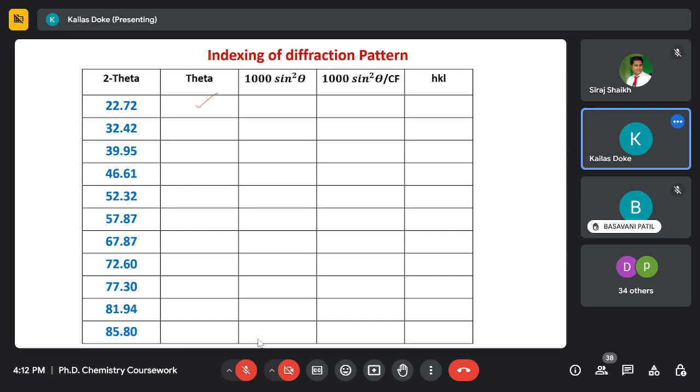Sine theta will be a fractional number, and the square of that fractional number is a further smaller number. So to convert that smaller number into a bigger number, multiply by some bigger integer number. Either you multiply it by 10 or 100 or 1000 or 10,000. That is your choice. So we got a somewhat bigger number from the smaller number.